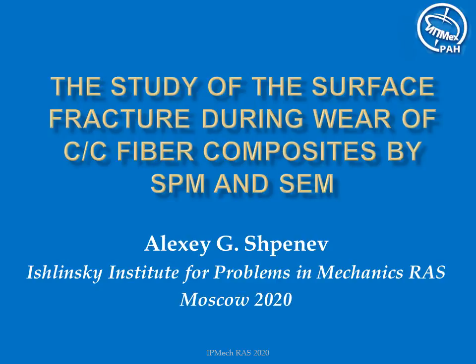This work is devoted to determining the surface fracture mechanisms of fibrous carbon composites during friction by scanning electron and scanning probe microscopy.